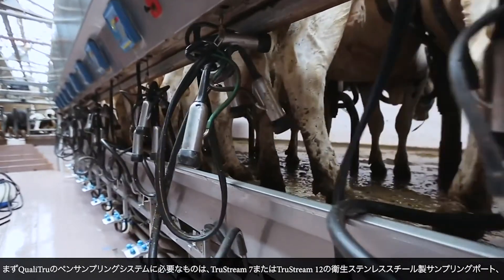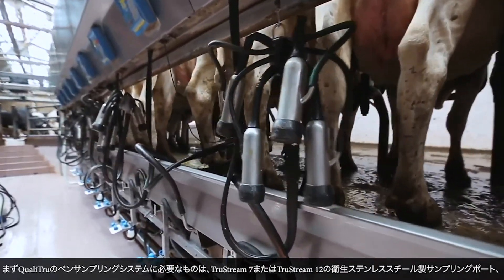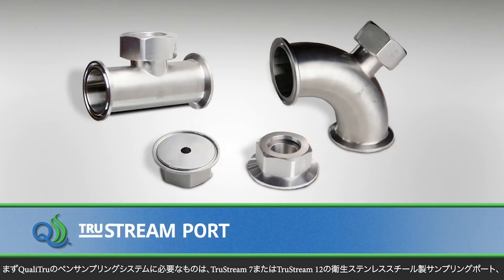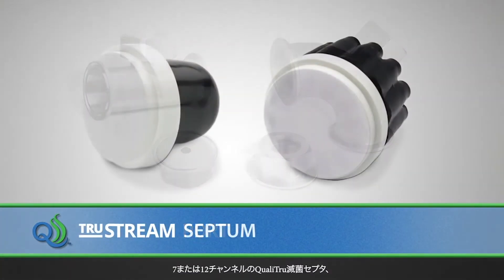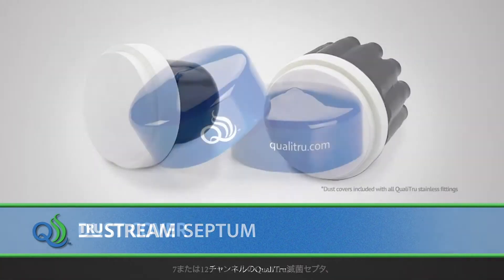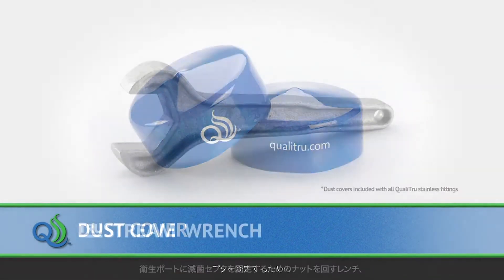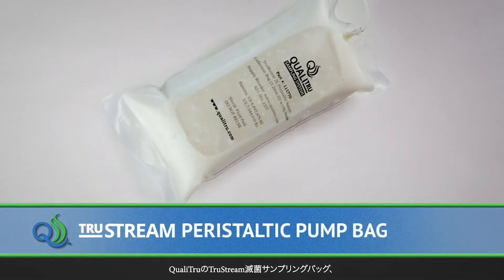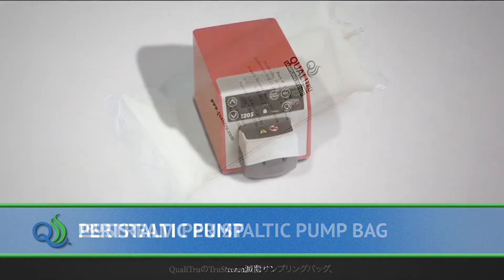The items needed for QualiTrue sampling systems pen or string sampling include a TruStream 7 or TruStream 12 stainless steel sanitary sampling port, a 7 or 12 channel QualiTrue sterile septum, blue dust covers, a wrench to tighten the nut used to hold the sterile septum and the sanitary port, and a QualiTrue TruStream peristaltic collection unit and a peristaltic pump.